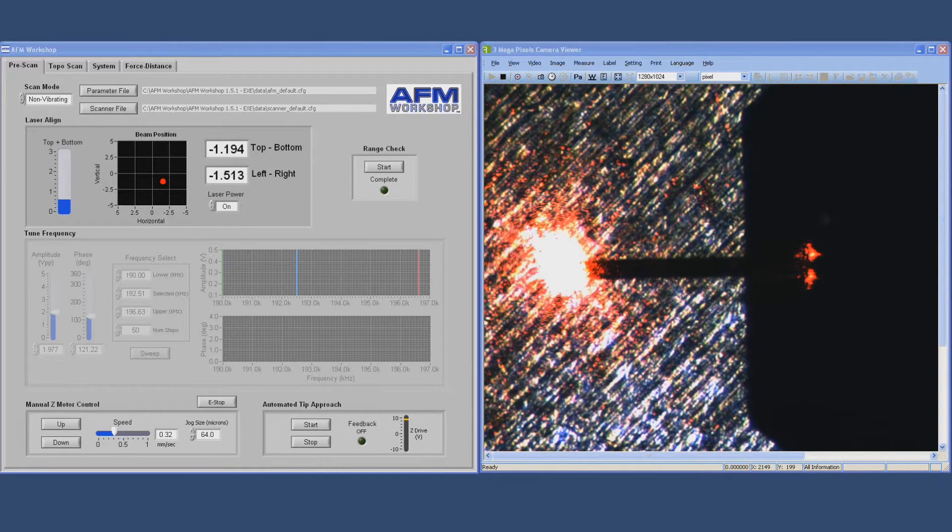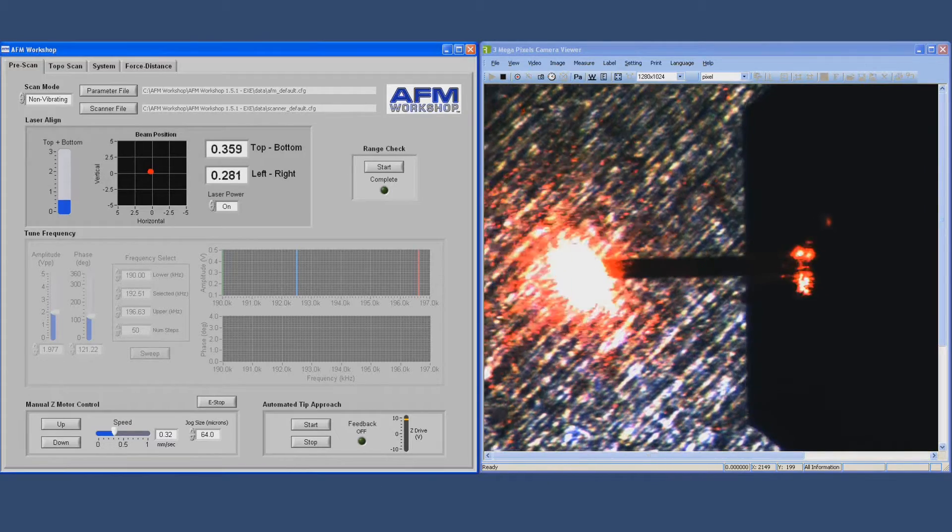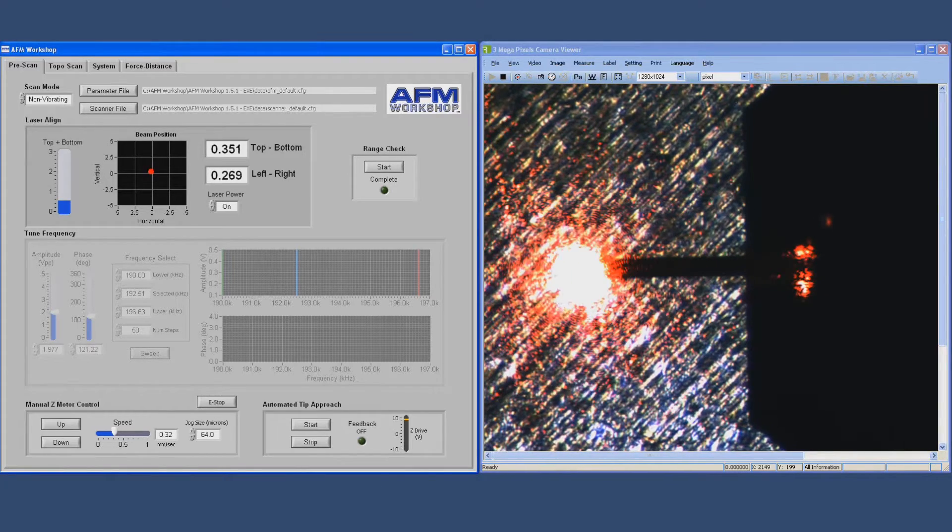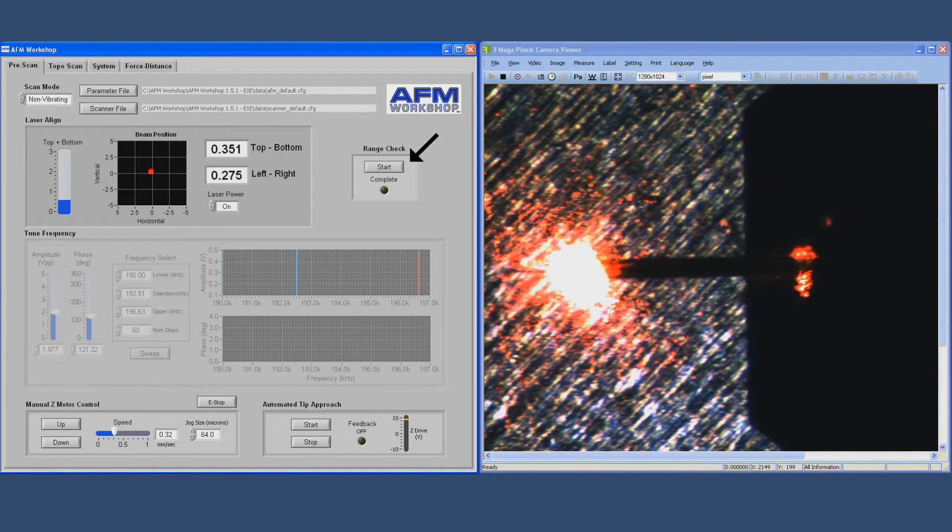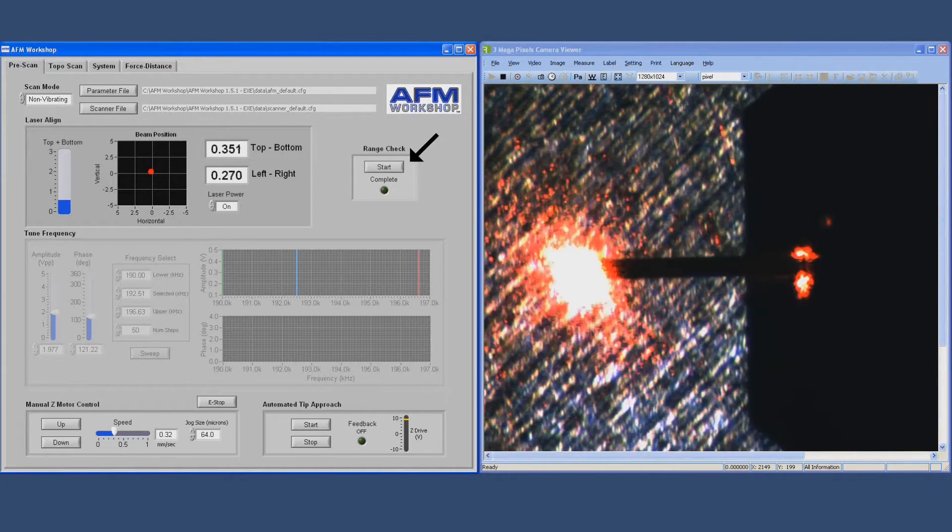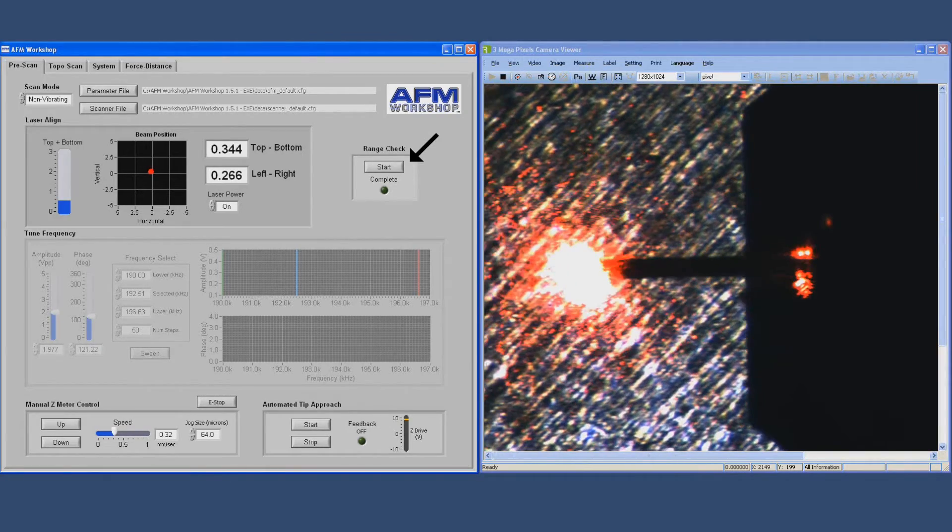Now to establish the calibration of the scanner, you do a range check which moves the scanner in a square box to find the absolute range of the scanner.